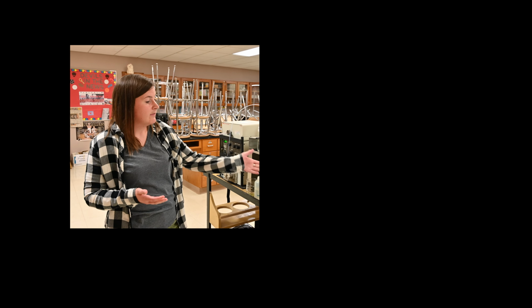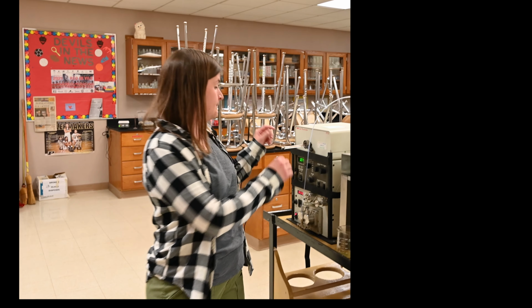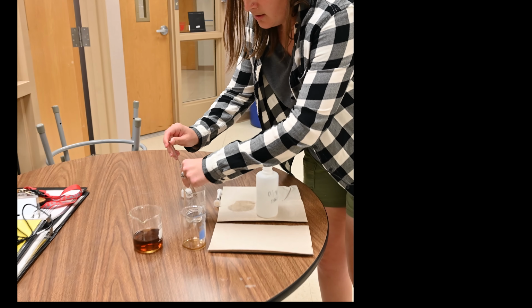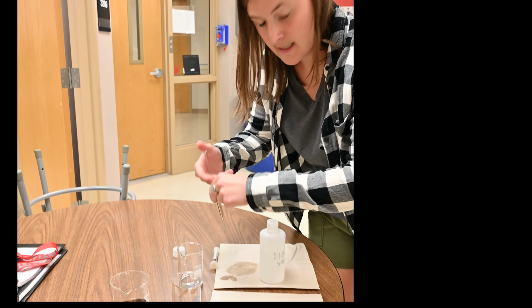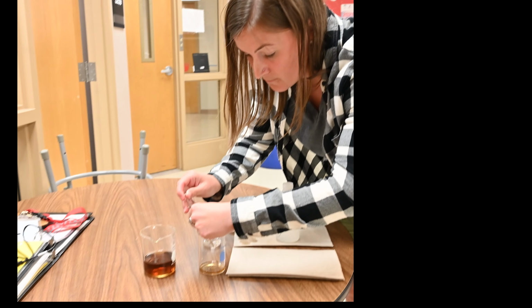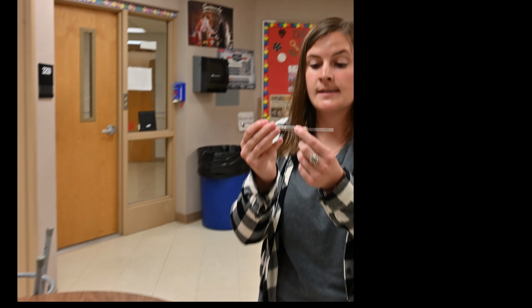So now that we have this idea of where our caffeine peak is, we are going to run our sample of our Diet Pepsi. So I'm going to unload my syringe. I'm going to clean it once again. Now, some preparation that I did for the Diet Pepsi is that I degassed it, so I got all of the carbonation out and I diluted it to about 1/2 of the molarity. So now I'm going to fill my syringe again with that same 50 microliters. Check for air bubbles, and now I'm ready to run my sample once again.